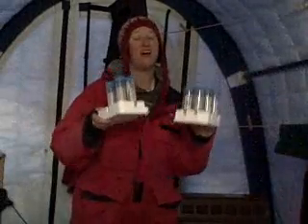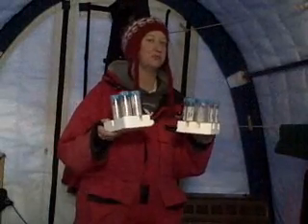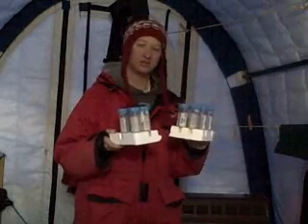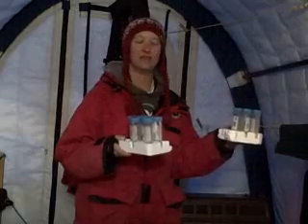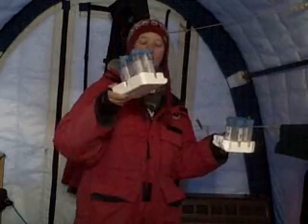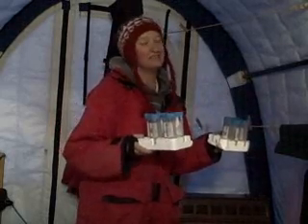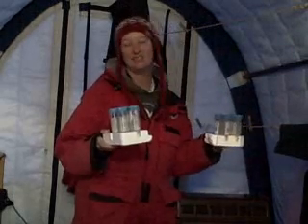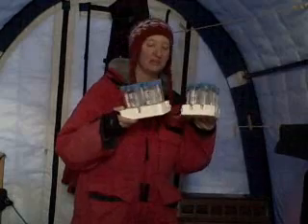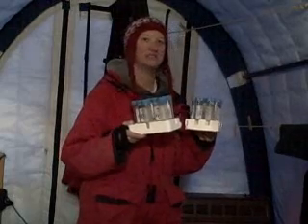Alright, now we have all of our samples in our vials and we're ready to go. So what we're going to do is leave the cold set outside in a box so that they'll be nice and safe and won't blow away. And then we're going to leave our warm set inside this nice warm polar haven, and we're going to check on them every day to see what kind of microorganisms start to grow in these guys and which ones we're going to see first.